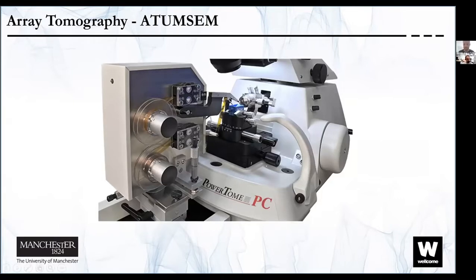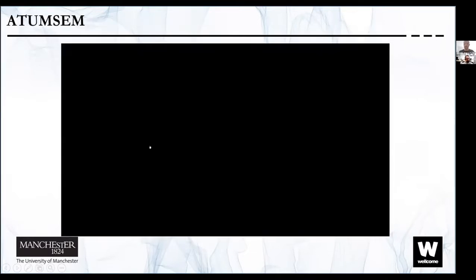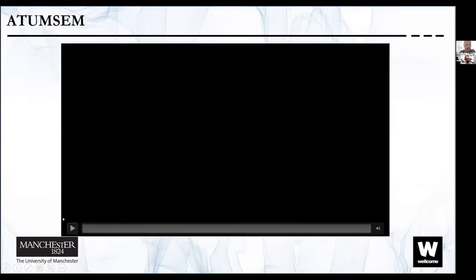This is a special ultramicrotome. Anyone who's used an ultramicrotome will recognize this area as being very reminiscent of just a normal ultramicrotome. You've got your arm with the sample, the diamond knife here, and the boat. What's unusual is this huge big metal box that looks like it's got a reel-to-reel tape machine on it, and that's where the samples are collected and stored. Got a video here which I really like. It really demonstrates the technique well, and it gives you a good visual idea of what's happening. So yeah, I might interject at one point, but we'll have a go.